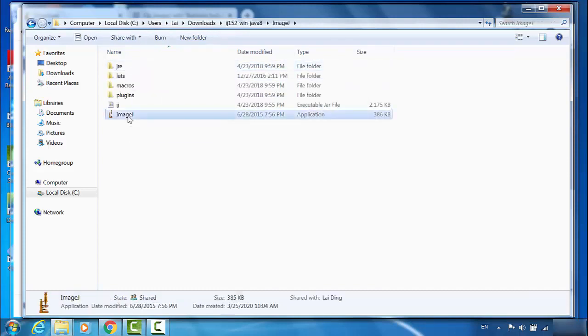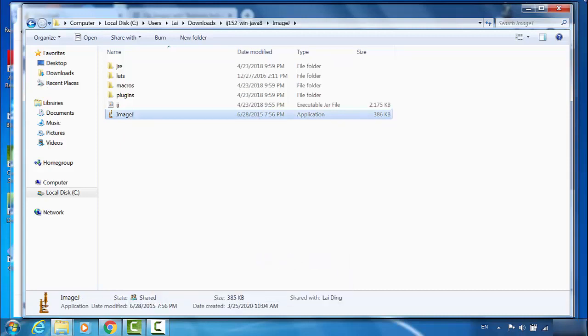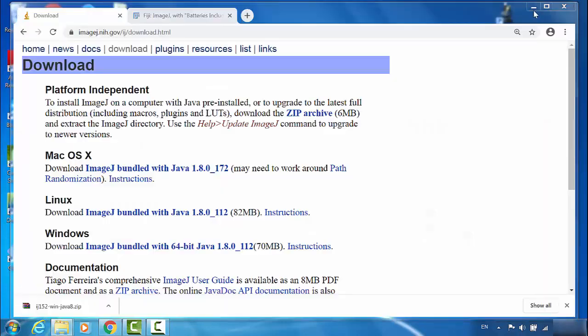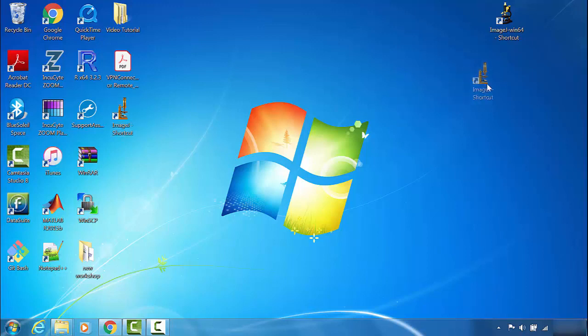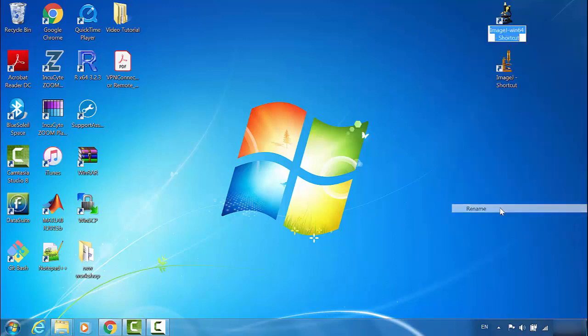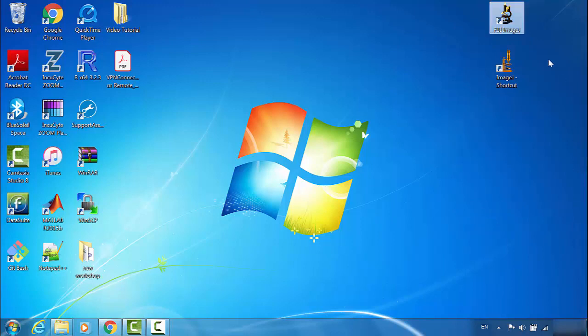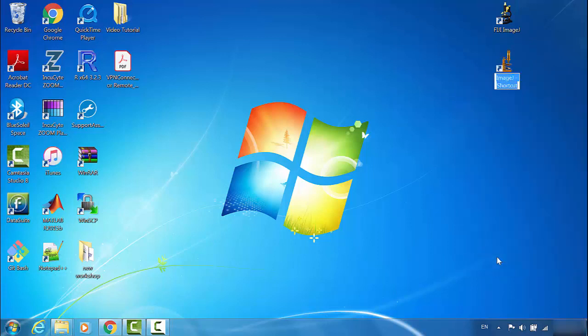Same as before, I'll send this one to desktop. Now you can see this logo is the NIH ImageJ and it compares to the Fiji ImageJ. Just to be clear, I will rename this one to Fiji ImageJ and this one to NIH ImageJ.